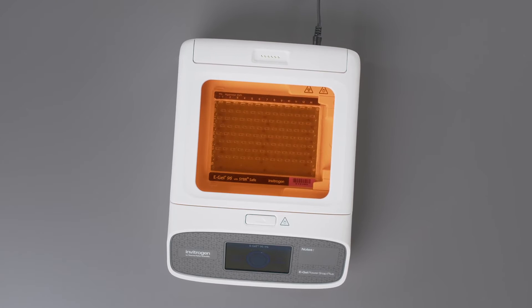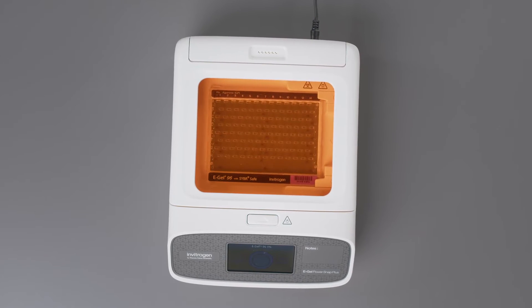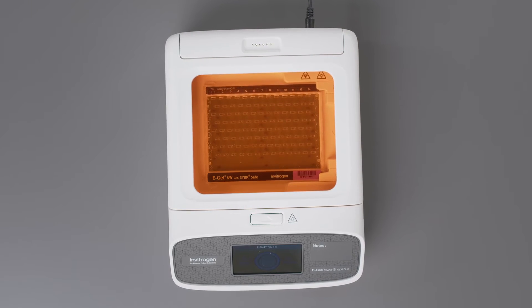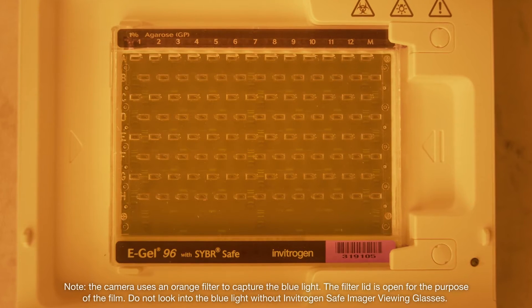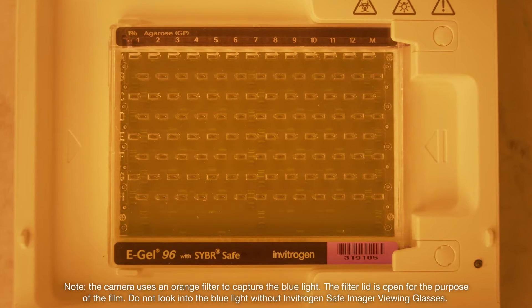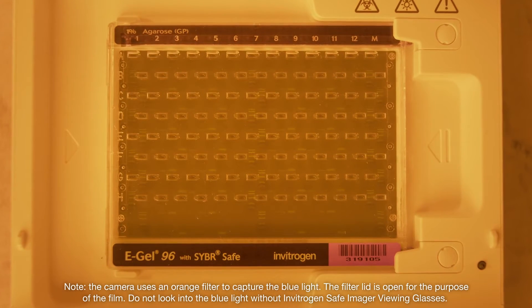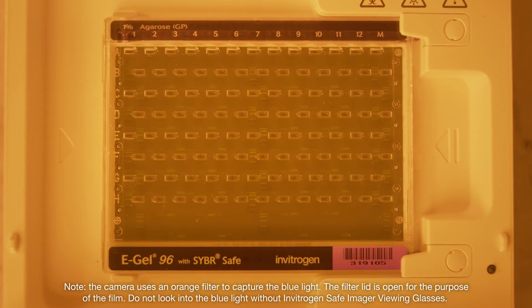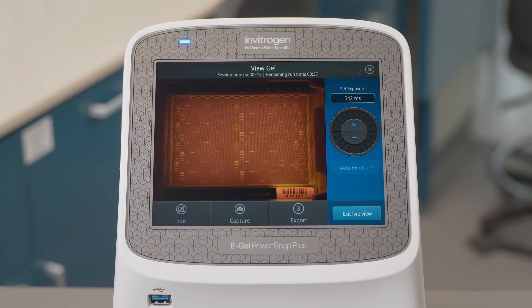One of the most beneficial features of the Invitrogen eGel PowerSnap Plus electrophoresis device is Live View. Using blue light for transillumination allows you to visualize your gel run progress in real time with just a glance at the electrophoresis device or the camera.